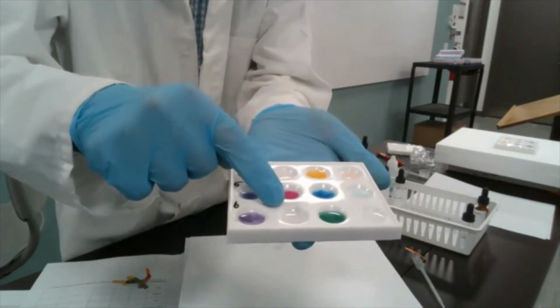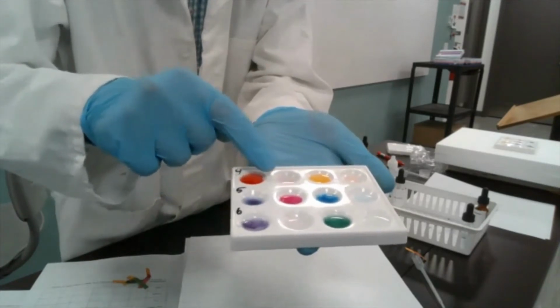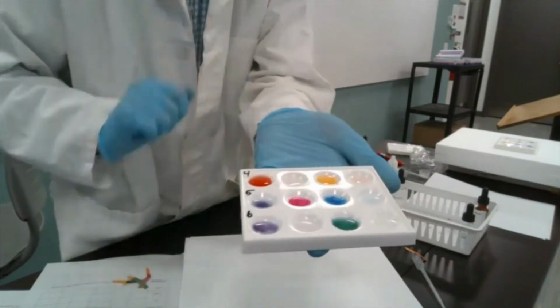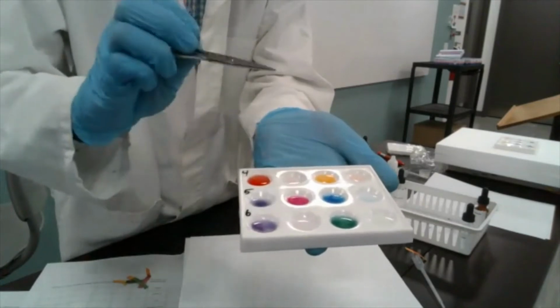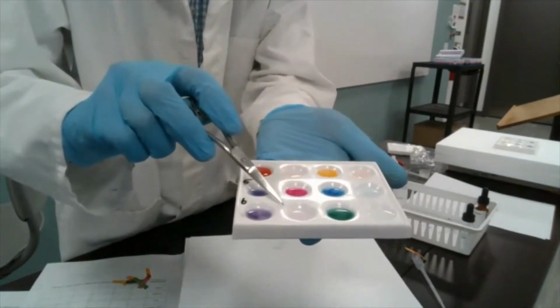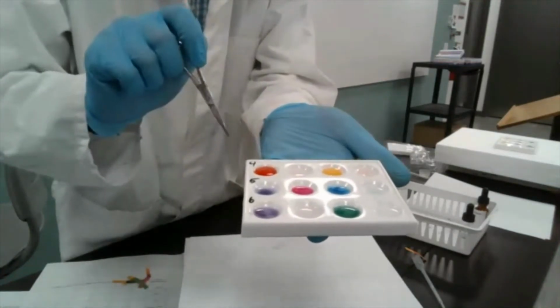If you compare phenolphthalein of the soap solution with that of the glass cleaner, you see that there's a marked difference. To me, phenolphthalein produced a very, very faint pink color that you may not even be able to see because of the camera. But it's very, very lightly pink, almost imperceptible. Compared to this, quite a difference, right?